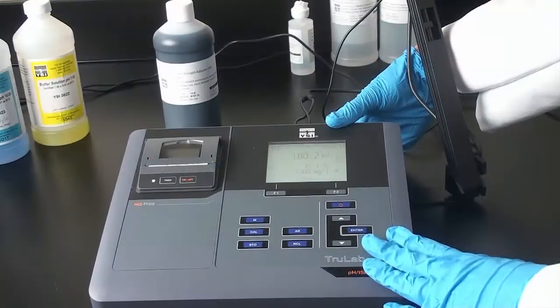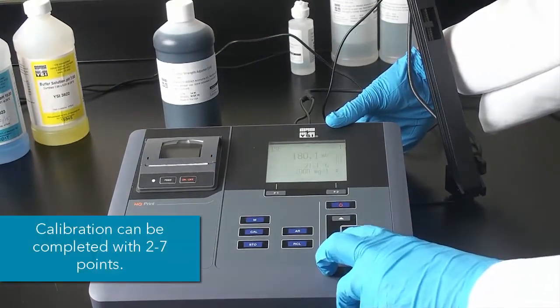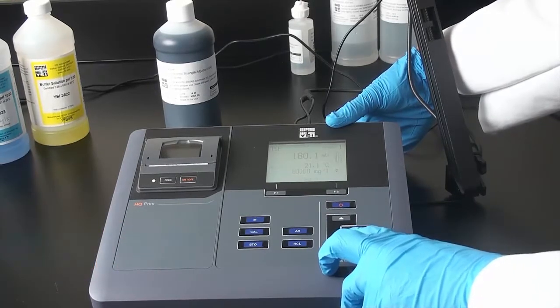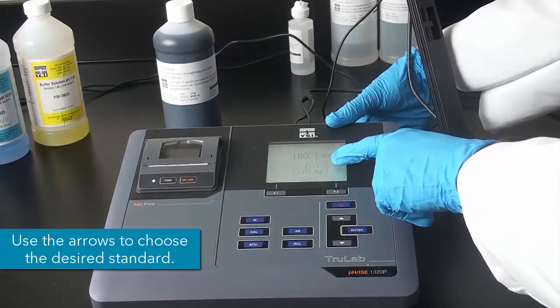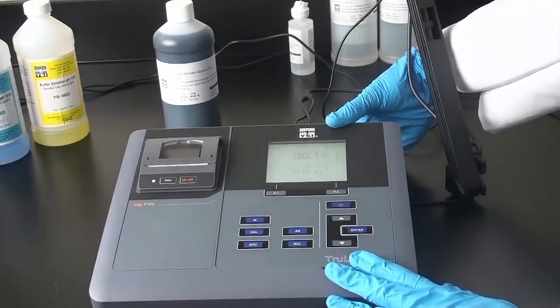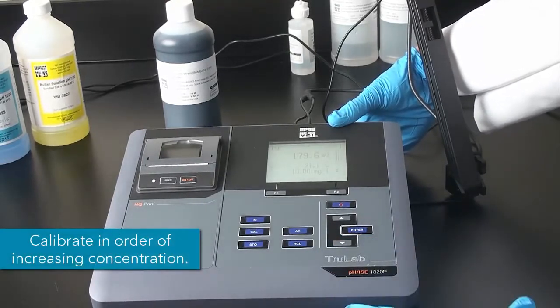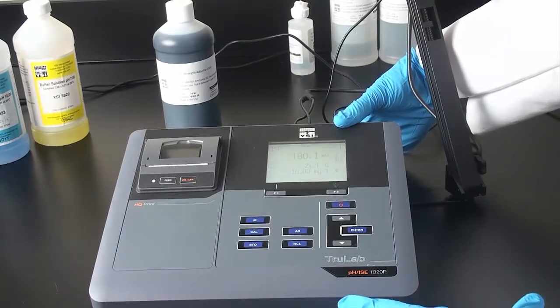So the TruLab can accept up to 7 calibration points, but for this I am just going to do 2. So what we will do is we will select our 10 mg per liter standard, and you can see this is the temperature reading from the pH electrode that we have. So at this point we are ready to start calibrating, and with that I will show you how to prepare your samples using ISA buffer.